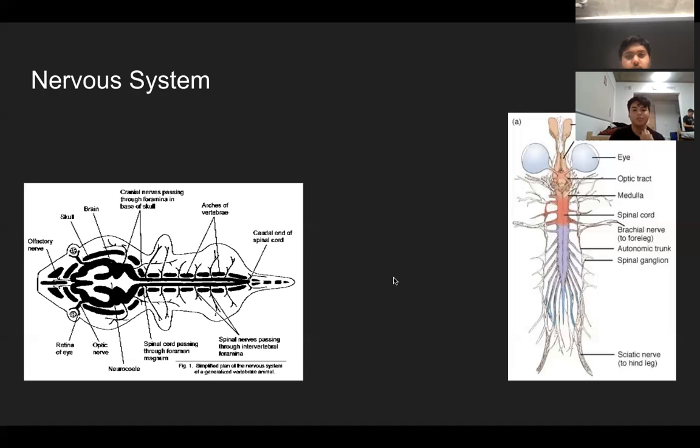Oh, how the muscles work, actually. Muscles are attached to bones by tendons and help them move. When a muscle contracts, it gets shorter, so it pulls the bone it's attached to. When a muscle relaxes, it goes back to its normal size. Muscles can only pull and cannot push. So that's what muscles do. Next, the circulatory system.